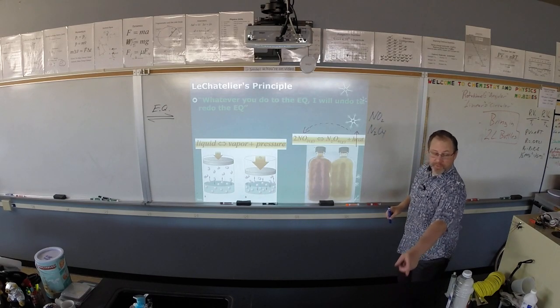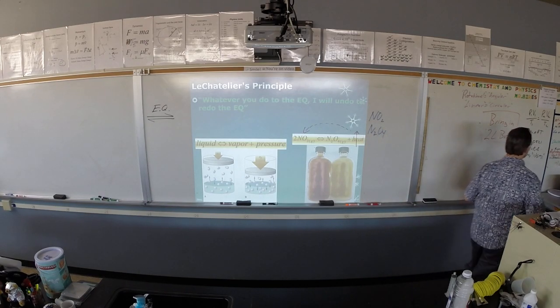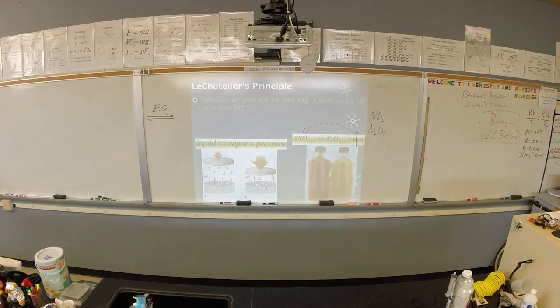Also, the one in the cold, the one in the cold, I reduced. Do I need to turn the light on so you can see the vials a little bit better?